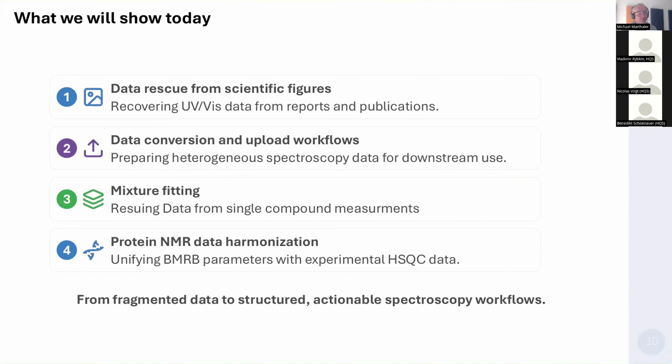for UV-Vis spectroscopy. Then comes a bit of a discussion about other software tools we have at HQS, which are about taking NMR data and reusing it and converting it and so on. And then also how to reuse this data for mixture fitting, as I already announced.